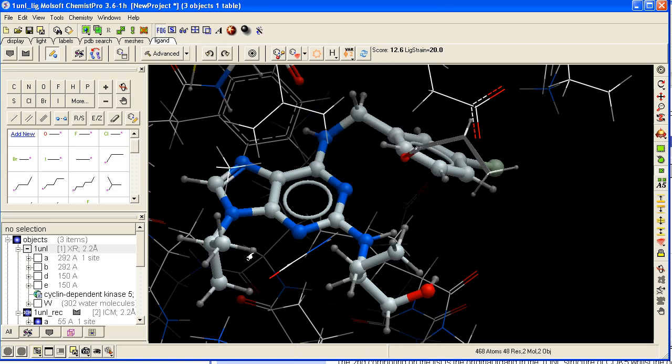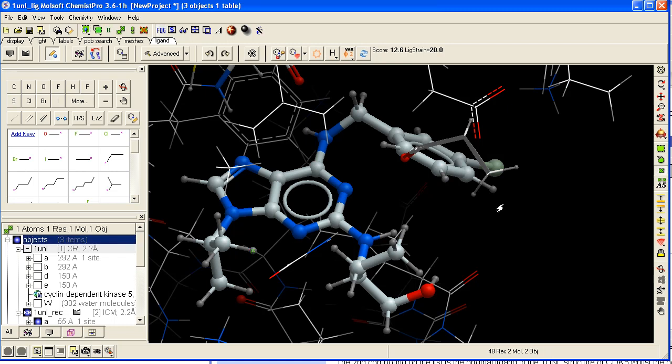Then select the hydrogen on which you want to start screening your substituents. Click on here, one atom, pick atom, click on the atom.